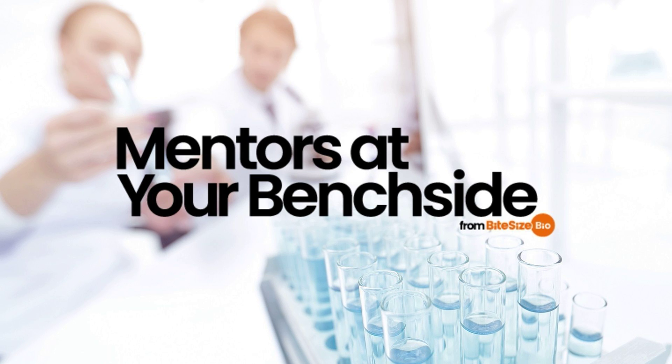From the relatively simple OD600 measurement to metabolite analysis, there are a plethora of ways to keep tabs on your growing bugs in the lab. Because the growth stage affects much within a culture, knowing how to accurately measure this parameter is a key technique in any bacterial lab.